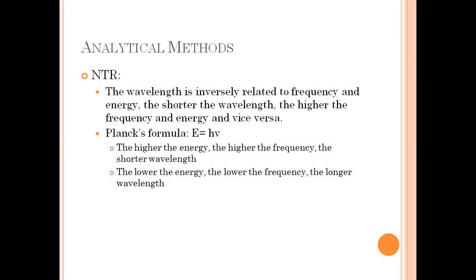That's why we have the so-called Planck's formula. Planck's formula states that energy is equal to hv, where h is the constant, whereas v is the frequency.